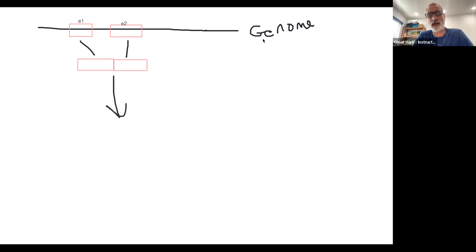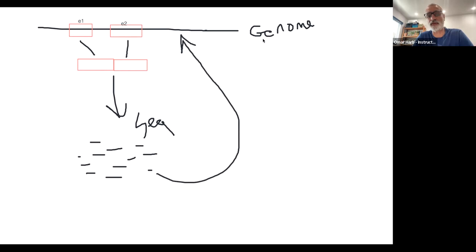So we send this to sequencing. With next-gen sequencing, you're going to get a bunch of reads coming from this particular transcript. So you'll get millions of reads, or hundreds, or thousands of reads from this transcript. Then the next step, typically, is you take them back and align them back to the genome. So this comes back here, and you align to genome.